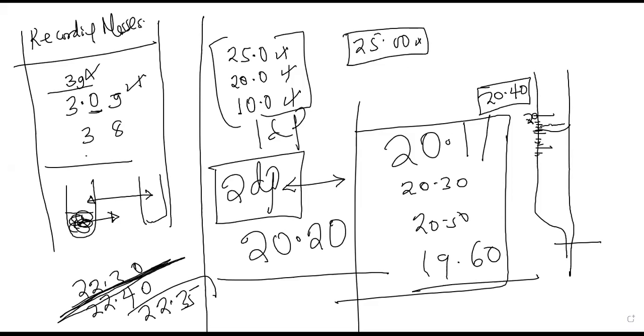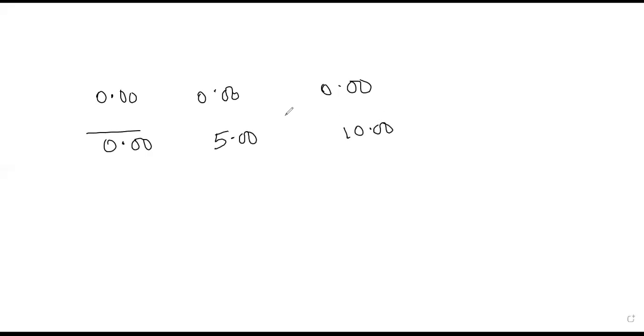So I'm saying that the starting point, the starting burette reading can be the same. One can say maybe 0.00, but we are wondering, aren't your solutions reducing? So one can start from 0.00. I can go now to 5.00, and then my other starting point can be 10.00. These ones can be my initial burette readings.